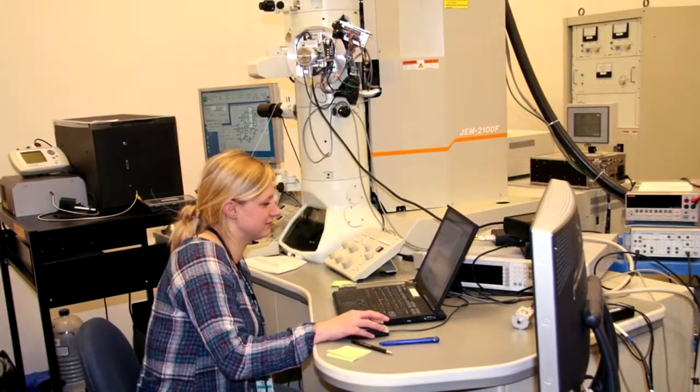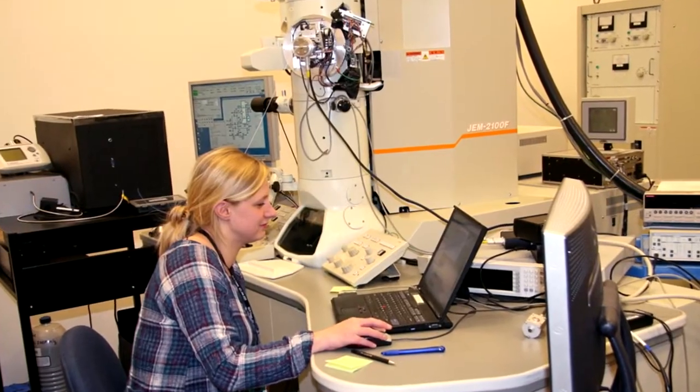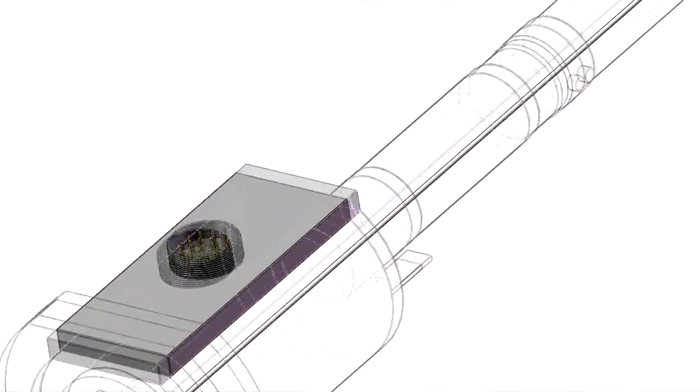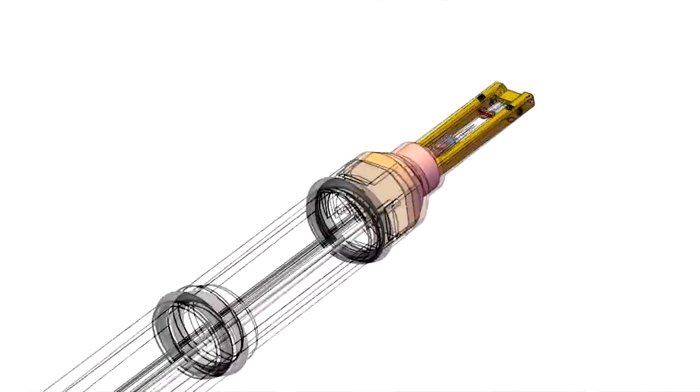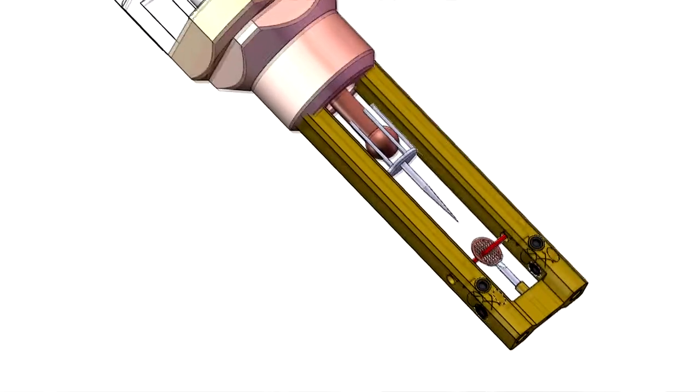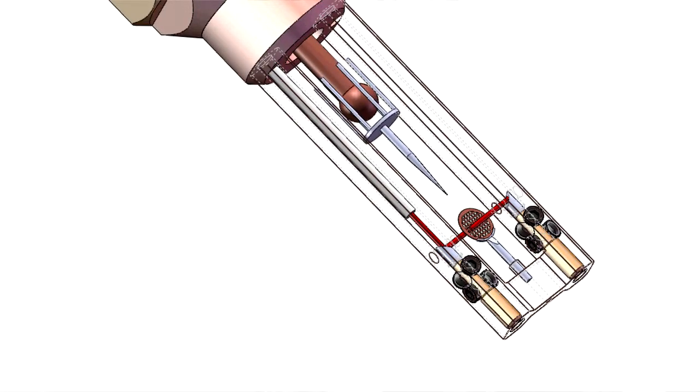The normal transmission electron microscope does only this. The goal of our product, the multimodal optical nanoprobe, or the MON, was to enhance its capabilities without having to radically redesign the whole system. And to do this, we built all of these additional techniques into the microscope holder itself.